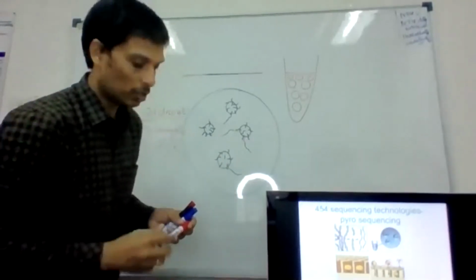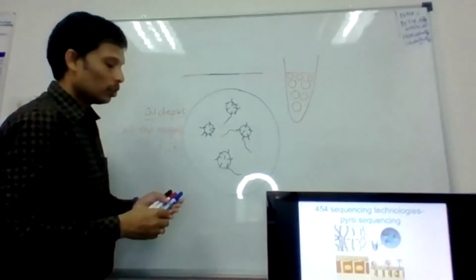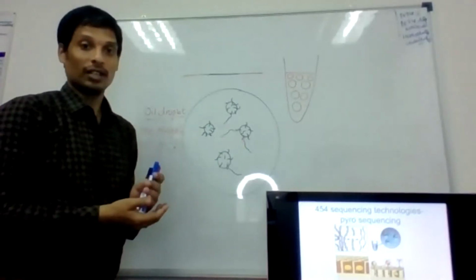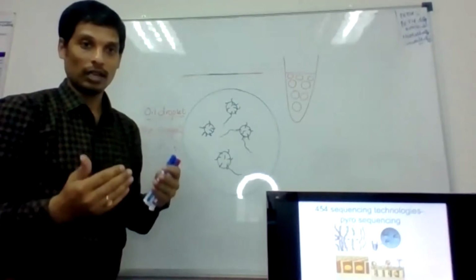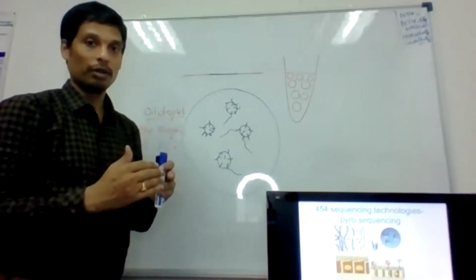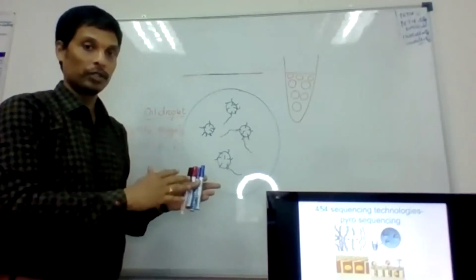The next step is you do the PCR. You keep this into the PCR machine. It will be slightly different from the normal PCR.